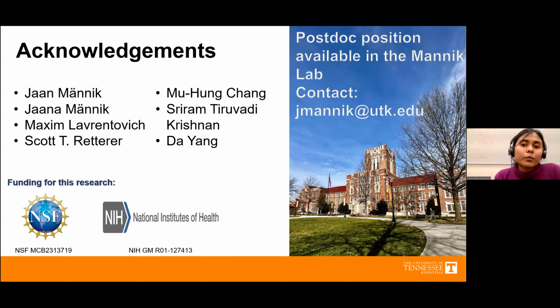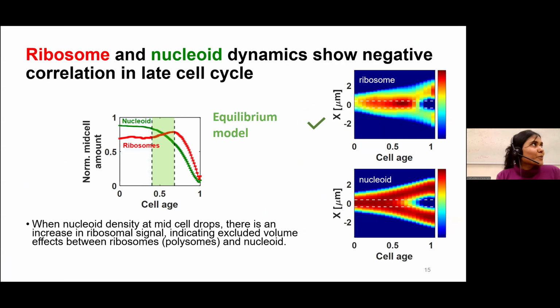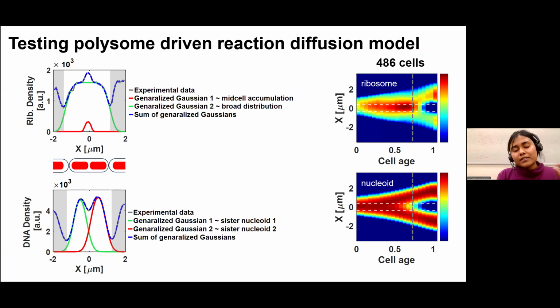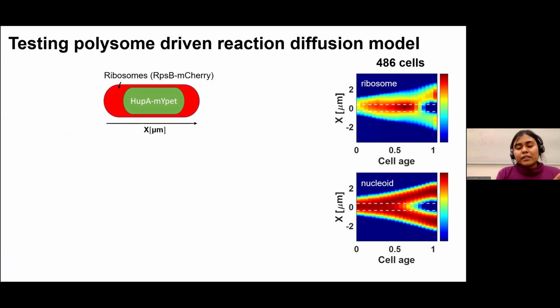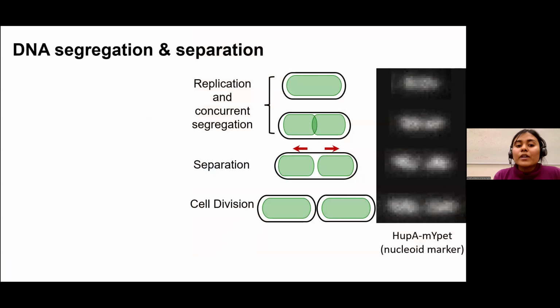Yeah, that's a great question. So after we get these images, we segment them using a convolutional neural network. I'm trying to go back to the very first slide. And then we track the lineage of these cells, so we can determine when the cell is born. The time where the cell divides or the cells fully separate marks the cell division for the mother cell, and it also marks the cell birth for the daughter cell. So we track it throughout the experiment, and we make a very big data set with all this information.